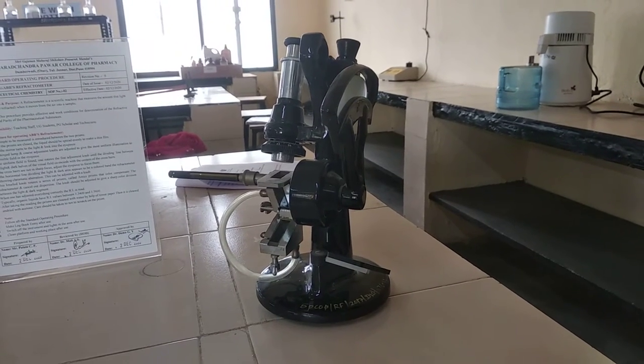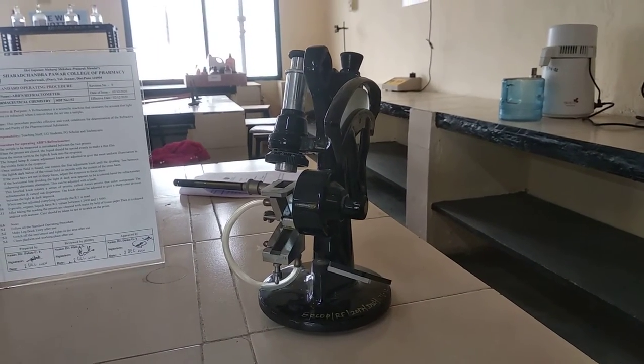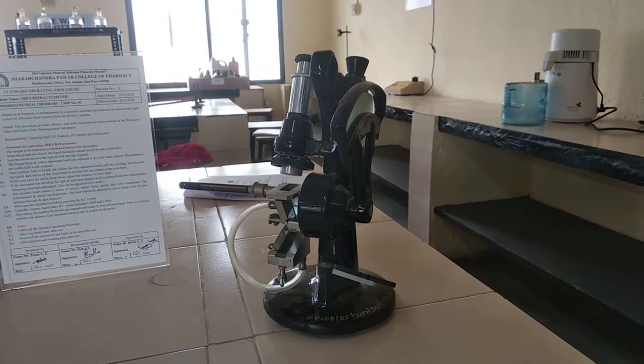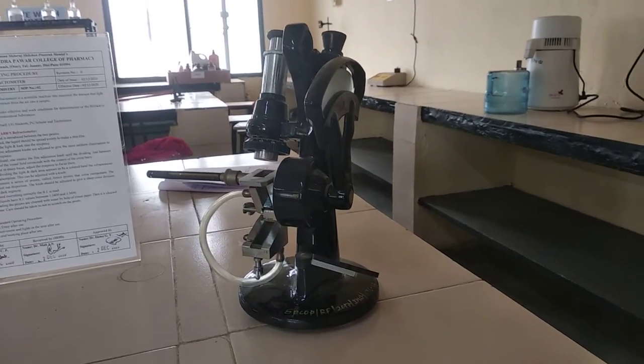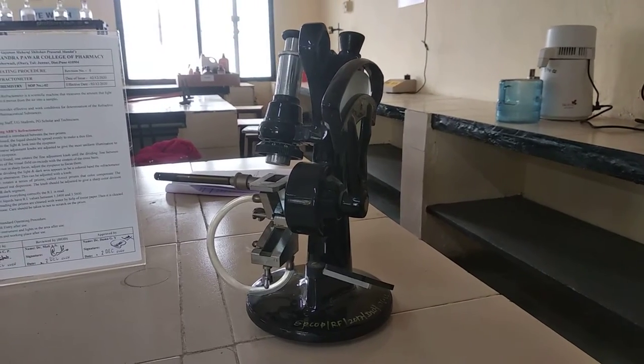Hello student, now we will see the Abbe refractometer. It is used to measure the refractive index of any solution or oil samples.